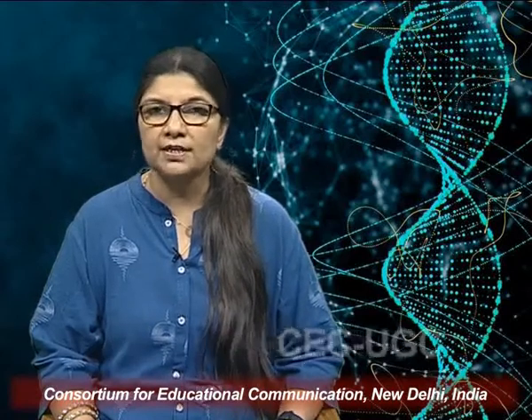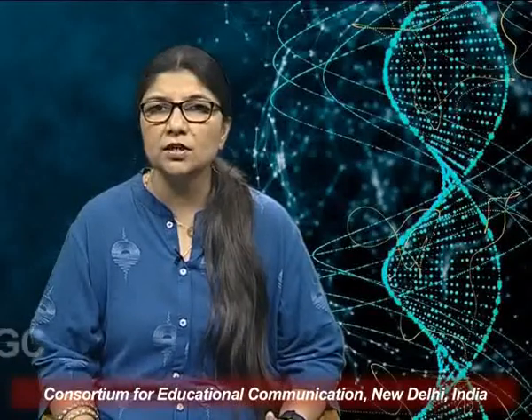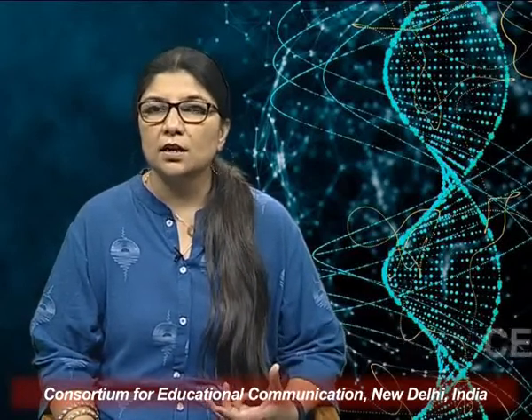And we require the DNA polymerase. Now this DNA polymerase and this PCR reaction basically came into being because of the discovery of a peculiar kind of DNA polymerase which was thermostable. Now what do you mean by thermostable? Thermo means temperature, stable means that it is resistant to degradation. It has got a high shelf life. So thermostable DNA polymerase is a DNA polymerase isolated from, for example, one of them called the Taq polymerase, which is isolated from Thermus aquaticus, which lives in an extreme environment and can withstand very high temperatures.